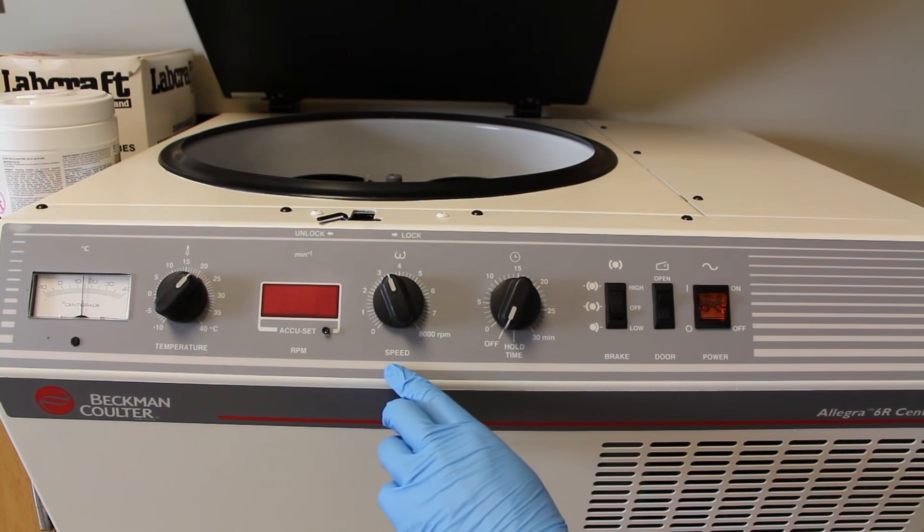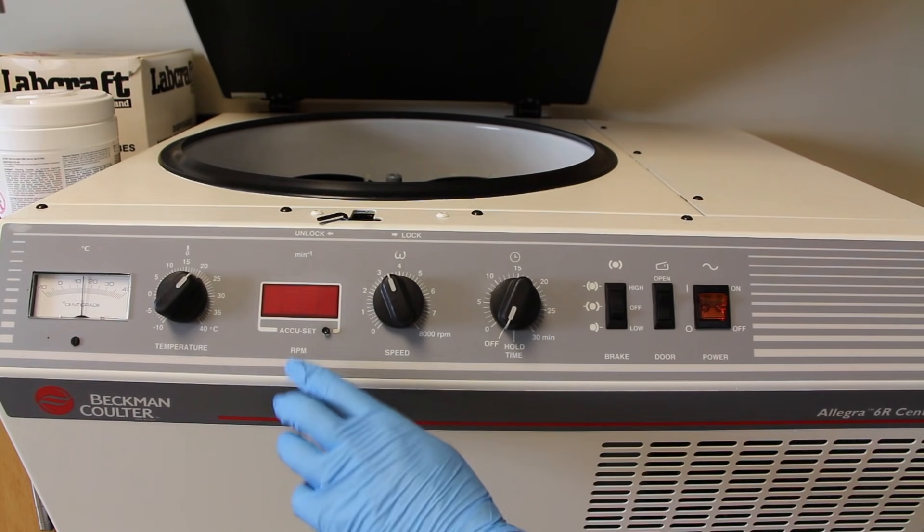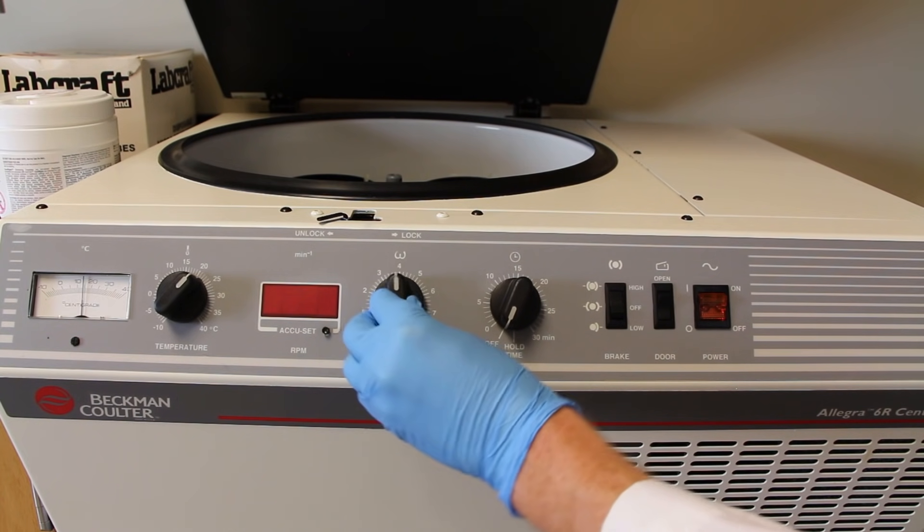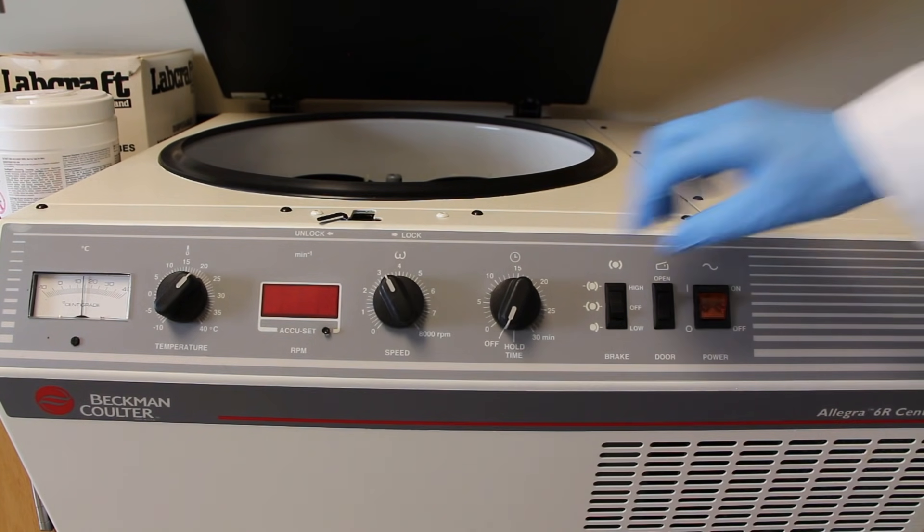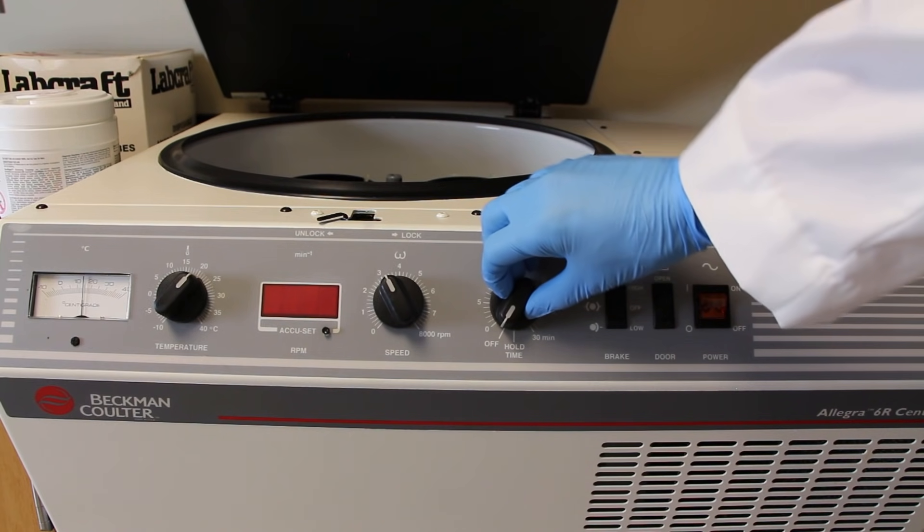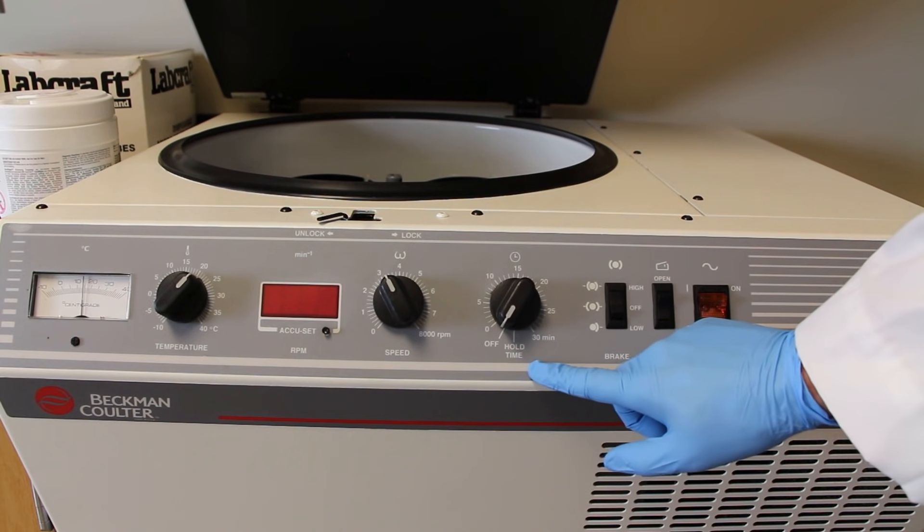The other things you can set are how fast it's going to spin. I'm going to spin it just beyond 3000 RPMs. You can also set the time of the spin, which is something that typically is between 10 and 15 minutes, and you can decide whether or not to have a brake applied or how heavily to apply that brake at the end of the centrifuge time period.